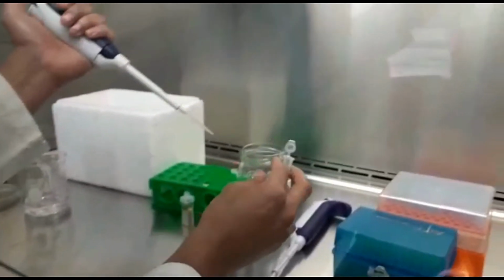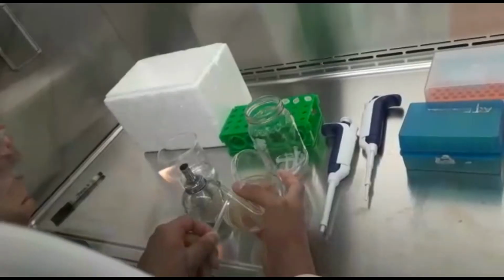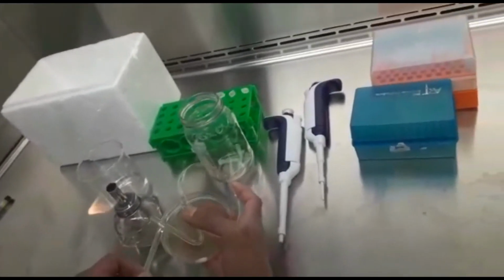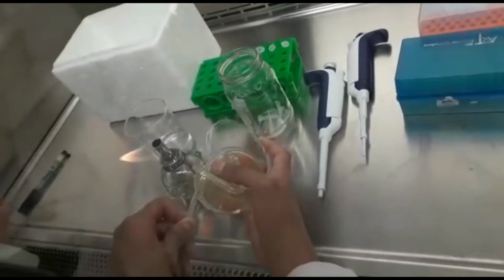The next day, we have to take a picture of the plate and store the plate in the refrigerator. With this, we have to pick 2 colonies, one white and one blue, of those that grew on the LB plate with X-gal and ampicillin to facilitate extraction of plasmids and verify the presence of the insert by digestion with restriction enzymes.